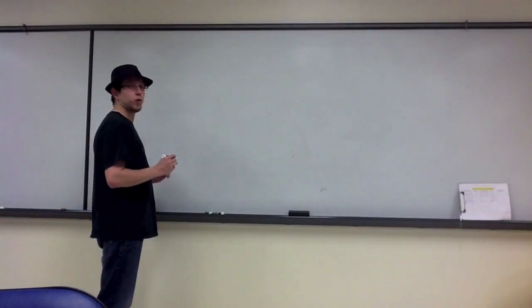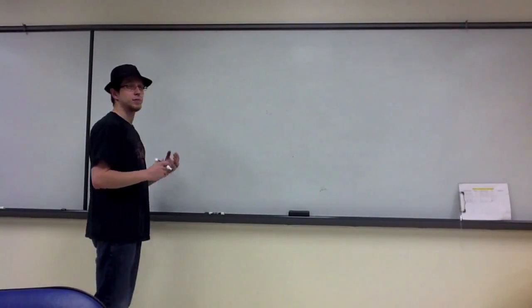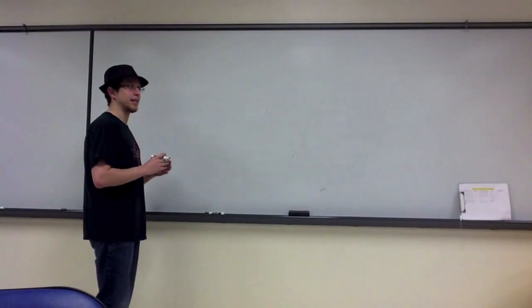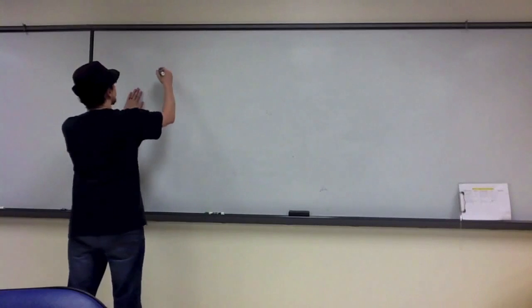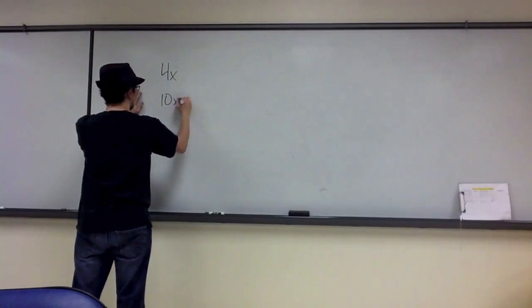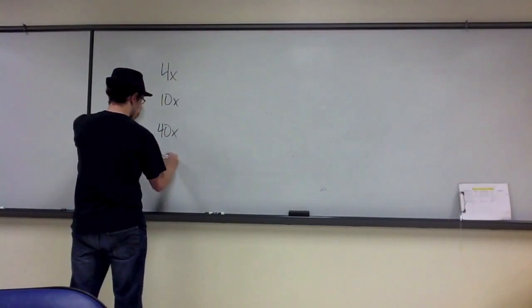So in this lecture, I want to talk about the use of the microscope in terms of the objectives and how to always keep a sample both in focus and in the center of view. So I want to start by talking about 4 different objectives and various characteristics that apply to each of these 4 objectives.